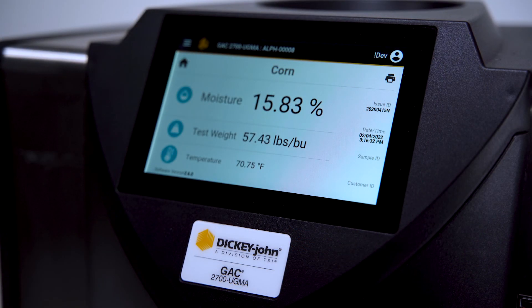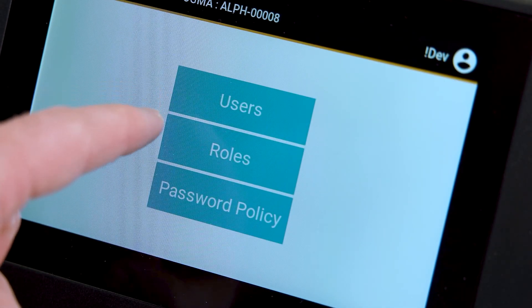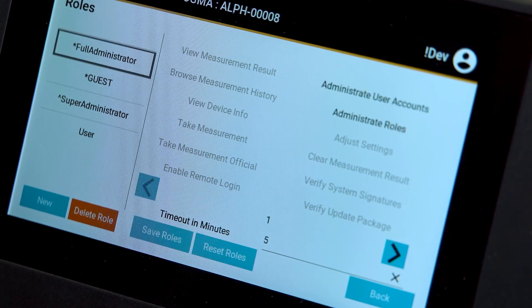The GAC 2700 UGMA Grain Moisture Analyzer is designed with enhanced security to reduce the likelihood of tampering by unauthorized individuals. Users are also able to customize instrument access to reduce the likelihood of costly mistakes.